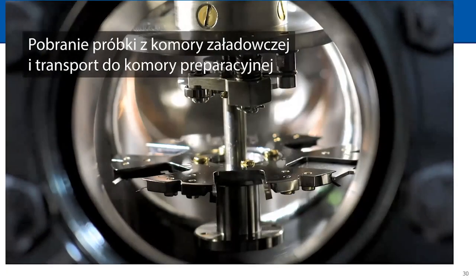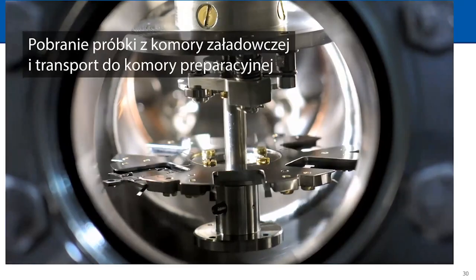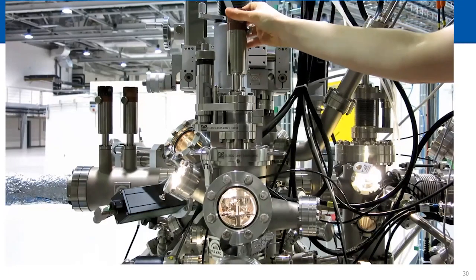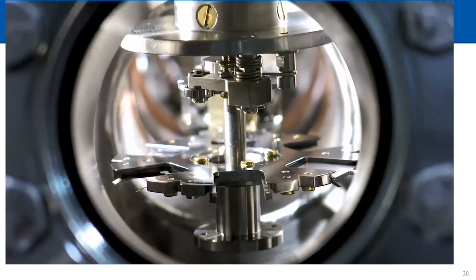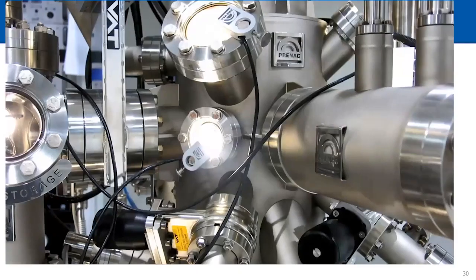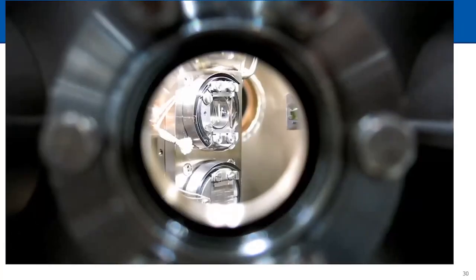And next we can transfer our sample from the load lock chamber to the preparation chamber by using the linear transfer. Here we see the preparation chamber.